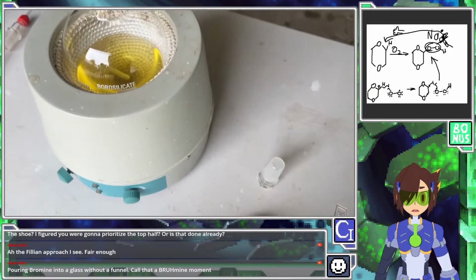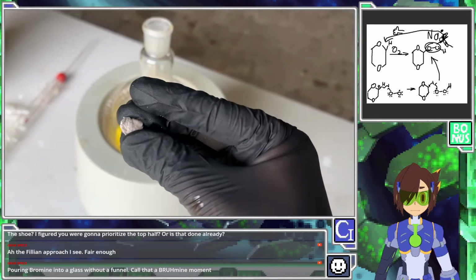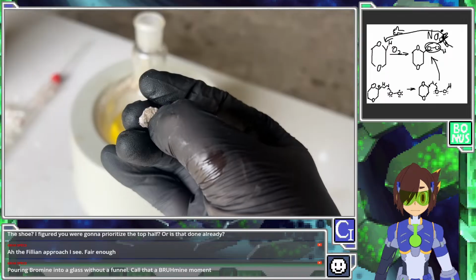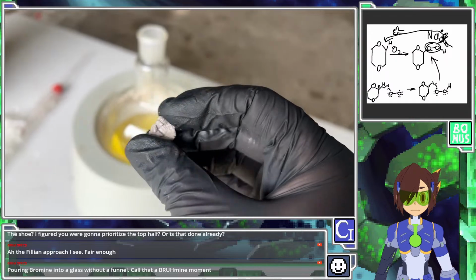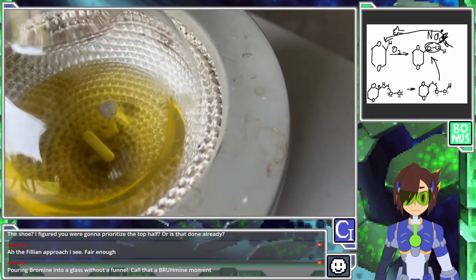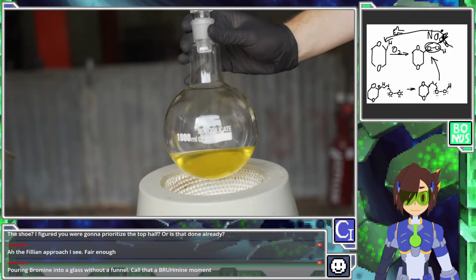But I mean, also, Tom, most people's dioxane isn't yellow either. They do just have lumps of sodium lying around. I mean, they're under mineral oil. There's a big block, but these are just small offcuts. You just cut into it. It is nice and shiny underneath, under all that crust, but the crust shouldn't matter either. Yeah, that bubbling there is any water getting destroyed. And that's good. Water is an enemy at the moment.